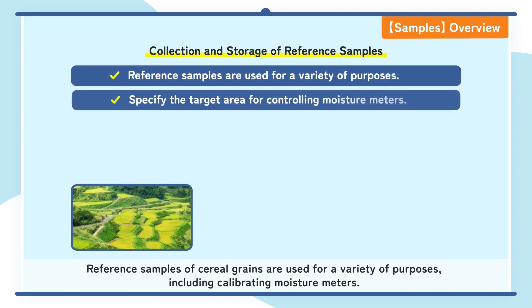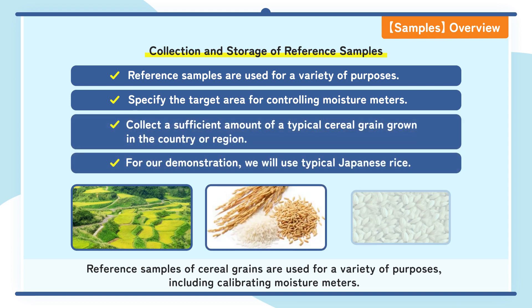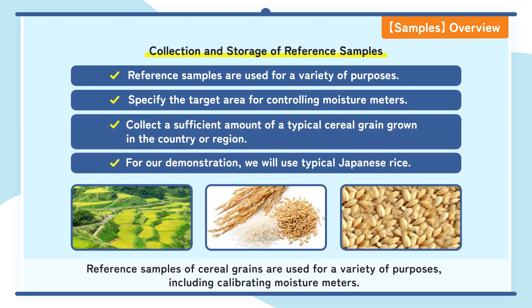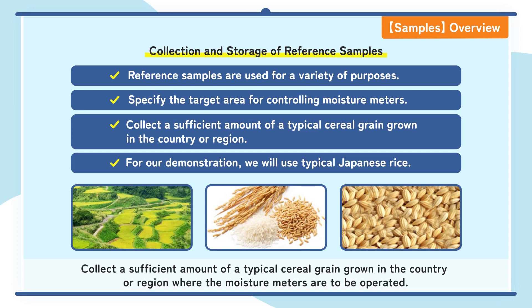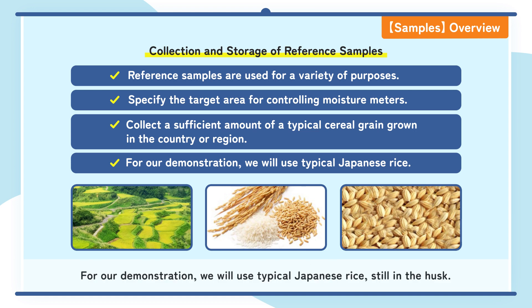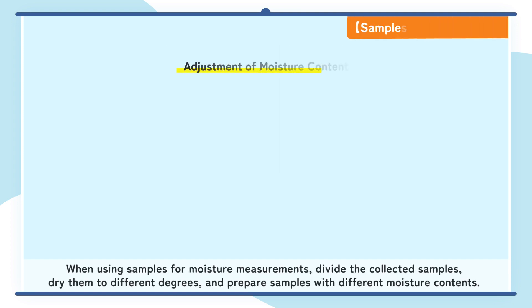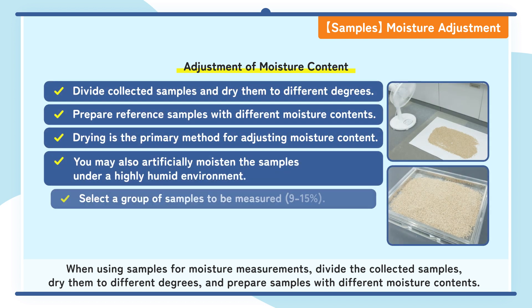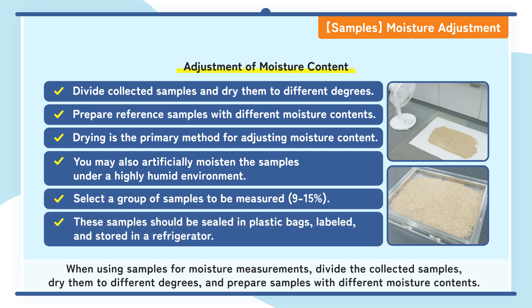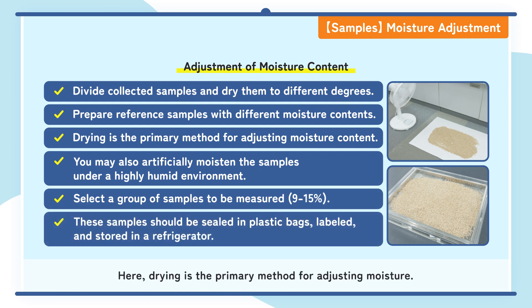Reference samples of cereal grains are used for a variety of purposes, including calibrating moisture meters. Specify the target area for controlling moisture meters. Collect a sufficient amount of a typical cereal grain grown in the country or region where the moisture meters are to be operated. For our demonstration, we will use typical Japanese rice still in the husk. When using samples for moisture measurements, divide the collected samples, dry them to different degrees, and prepare samples with different moisture contents.